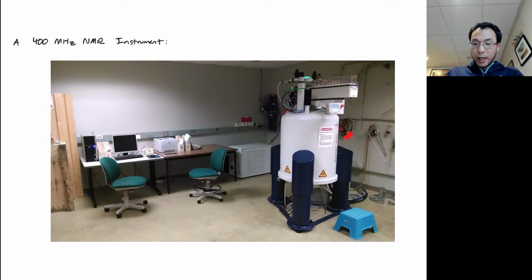If you're looking at this white tank-like object here, the white part is the shield, and inside this shield is the strong magnet. The reason we need a shield is because if this magnet was just exposed to the outside, everything metal in the room would just get sucked into that magnet, and then the magnet would break.